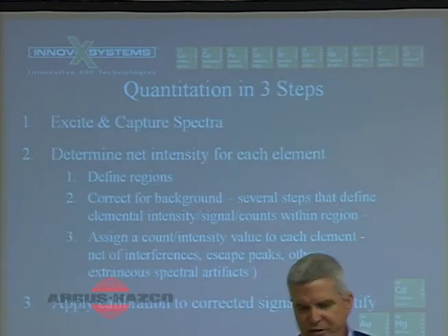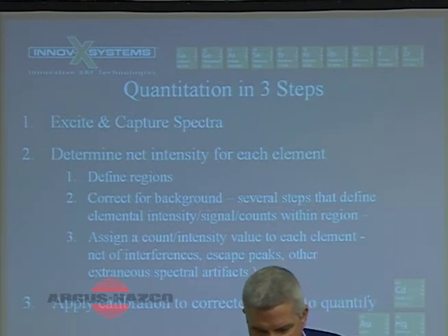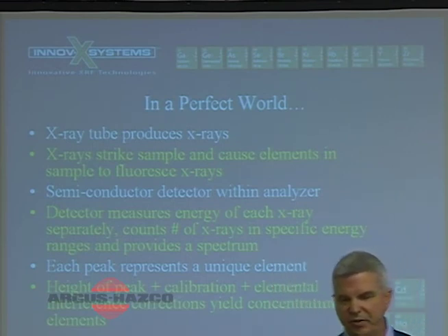So quantitation is in 3 steps. You don't really have to remember all these things. But I just wanted to go through this very quickly so you get an idea of what's happening, okay, and why we need X-rays to do this job.